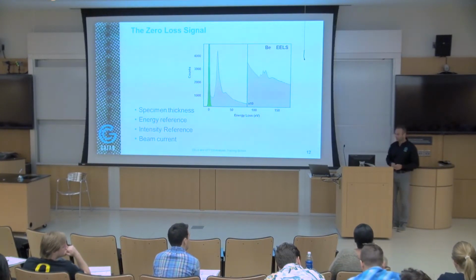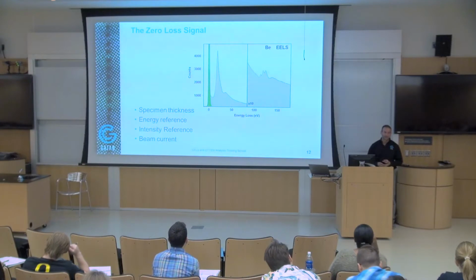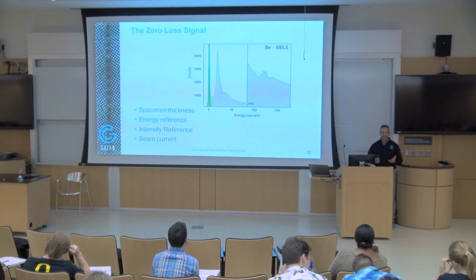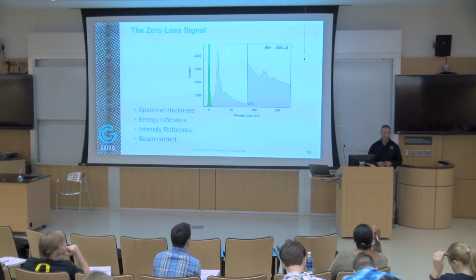Sometimes it gets close, sometimes it's very far. So it's actually very important when you work this out. You can work out the areal density easily, but the problem is when you want to go down to volumetric density, you need the absolute thickness value, which depends on the lambda, and then you might get errors on the lambda. So you have to be a little bit careful on that.